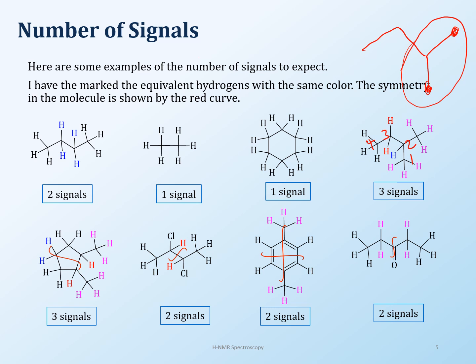They're symmetrical. Why is it symmetrical? Because it is attached to a carbon which also has a hydrogen. It is attached to a carbon that is a CH2. So both of these are attached to the same kind of carbon. So they are identical. So the 6 pink protons are going to be the same. The blue proton, which is this one right here, that's going to be different, because that does not resemble anything else.